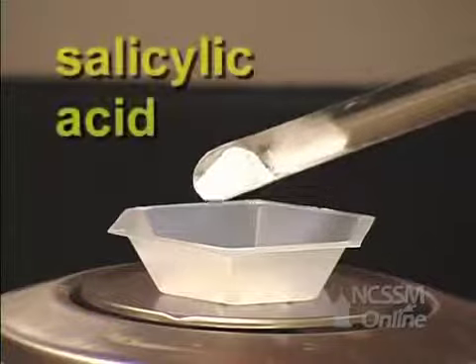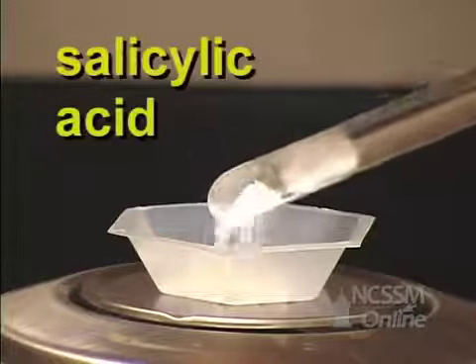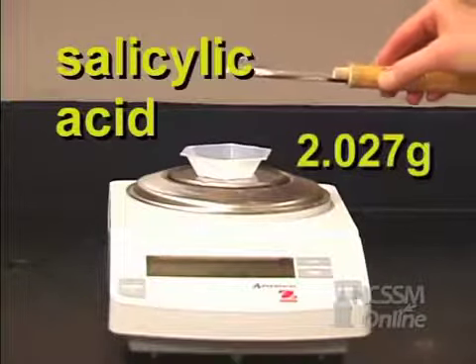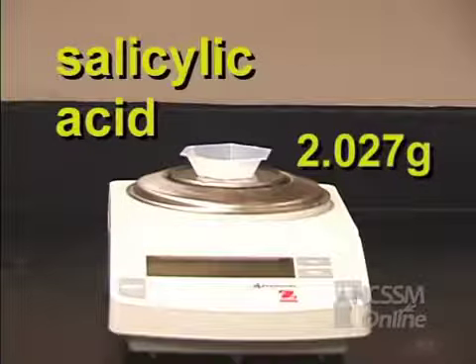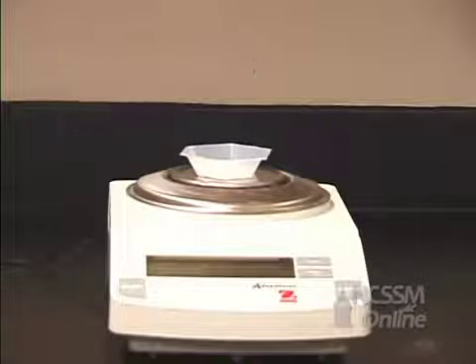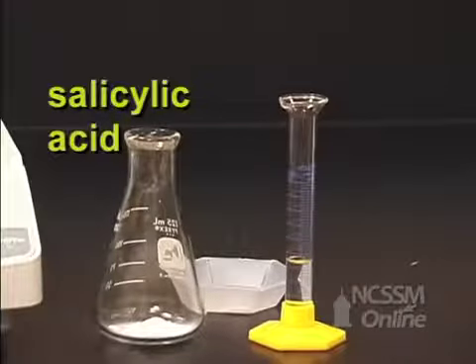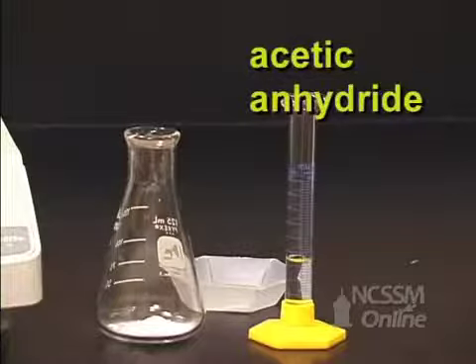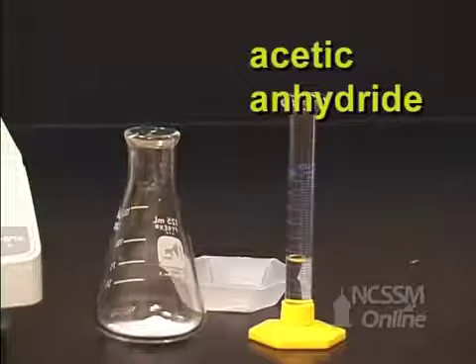We want to weigh out 2 grams. Actually, we have 2.027 grams. So record that number. Now we want to add between 4 and 5 milliliters of the liquid acetic anhydride.